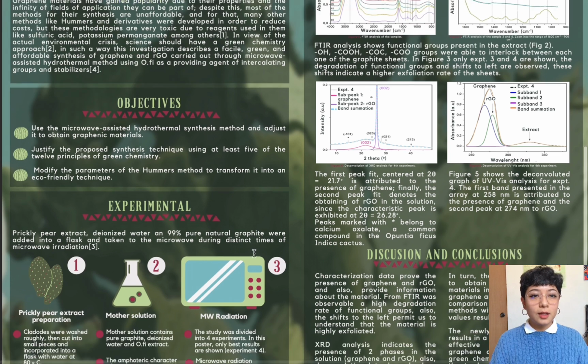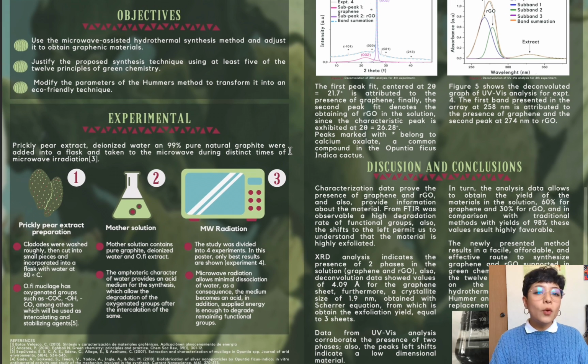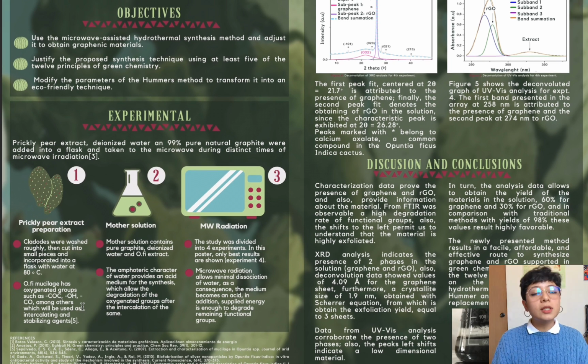Now, the experimental part. Prickly pear extract, deionized water, and 99% pure natural graphite were added into a flask and taken to the microwave during distinct times of microwave irradiation. First, extract preparation. Cladodes were washed thoroughly, then cut into small pieces and incorporated into a flask with water at 80 degrees. As you might know, Opuntia ficus indica has a lot of oxygenated groups such as epoxy, hydroxyl, and ketones, among others, which will be used as intercalating and stabilizing agents. This meets the first Hummers' method requirement, oxidative reagents.